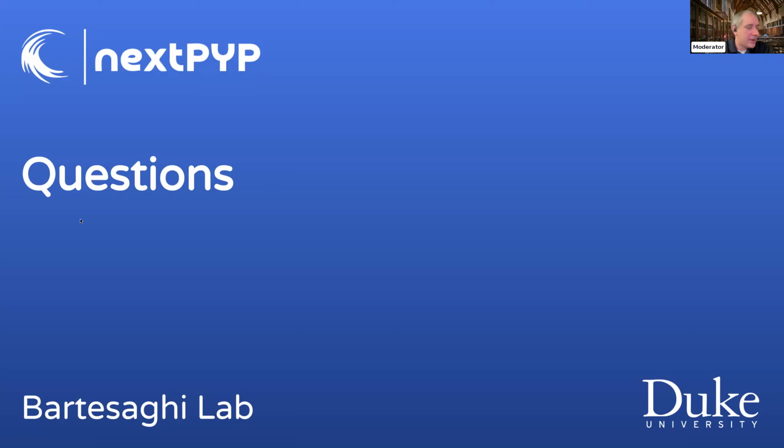All right, so we have time for a couple more questions. There is a question also regarding bringing data back into nextPYP. The specific question is how easy it is to bring data in at different steps. For example, can I upload tomograms to try the neural network picking? And then can I export those particle positions as a star file?